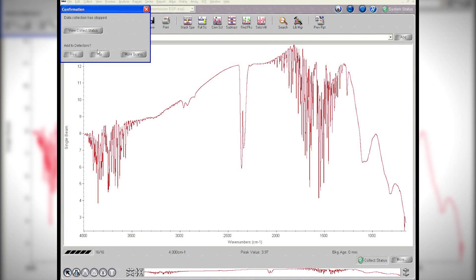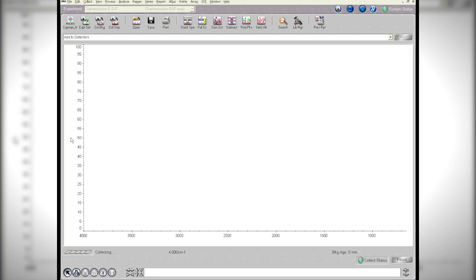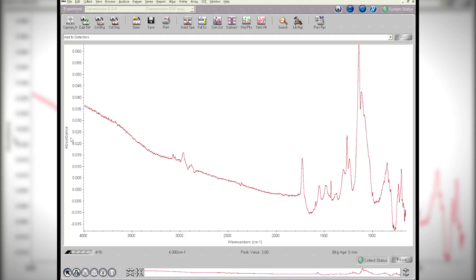I don't need to see the background, so I'm going to delete that. And then I'm just going to collect my sample. So now as it scans, you'll see it collect the sample, you can see the very smooth background and everything here.